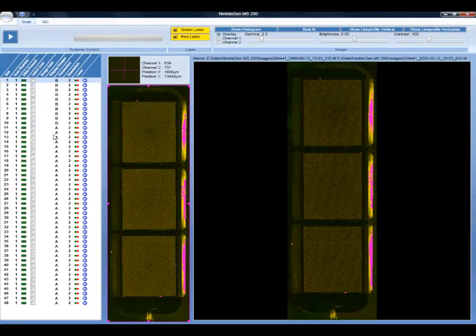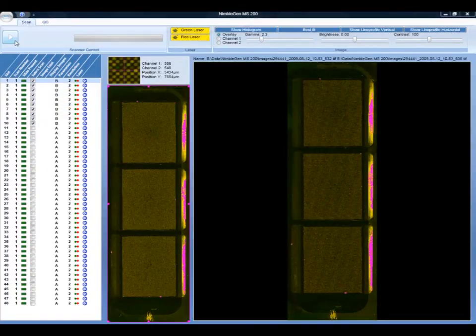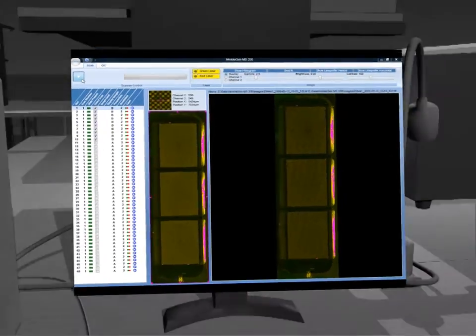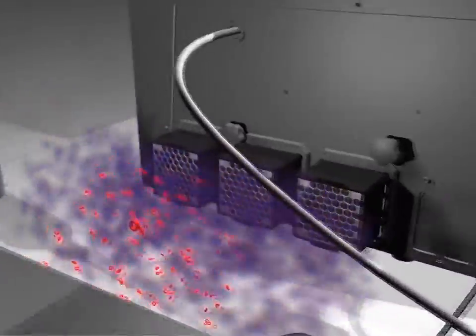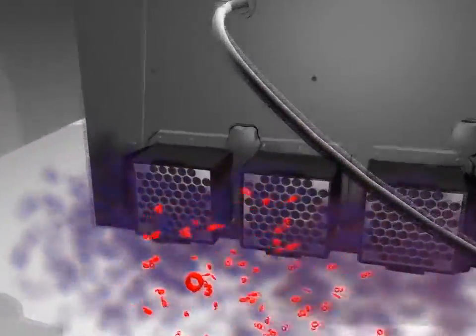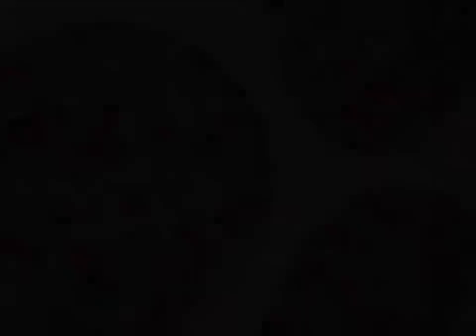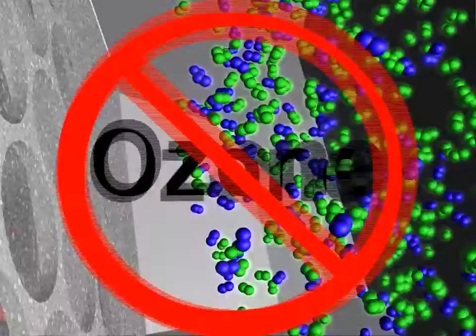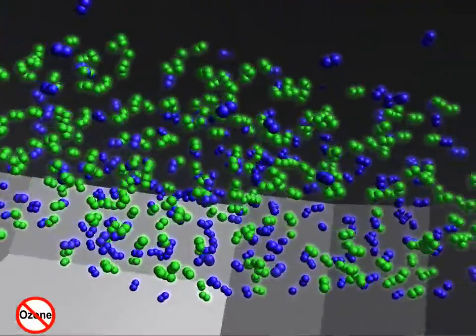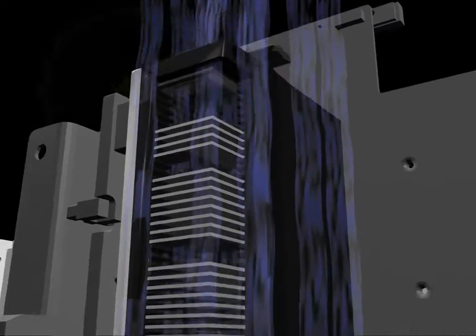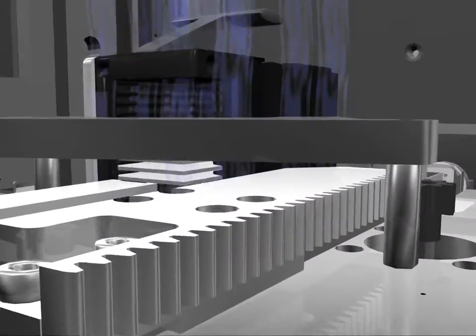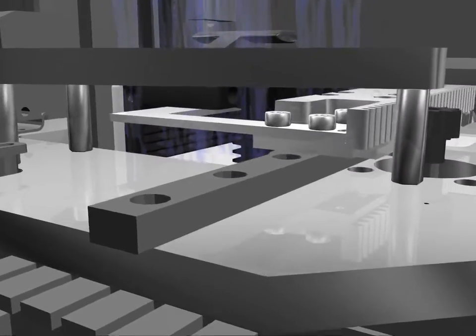Interactive graphic representation of the measurement parameters provides certainty for fine adjustments. The MS200 air filter system helps block lab ozone from entering the instrument. This drastically reduces radical and particle concentration in the instrument, thus protecting sensitive experiments in the slide magazine.